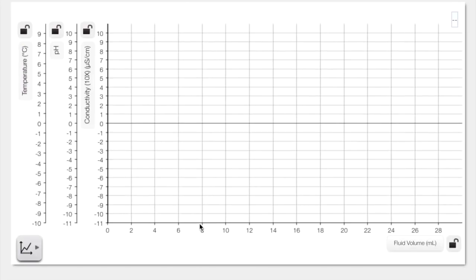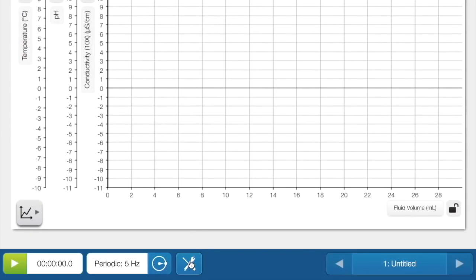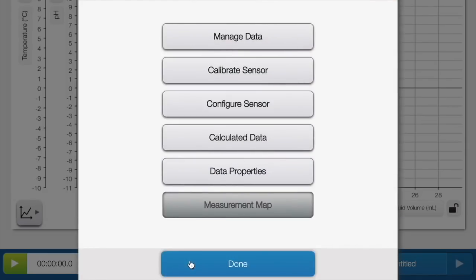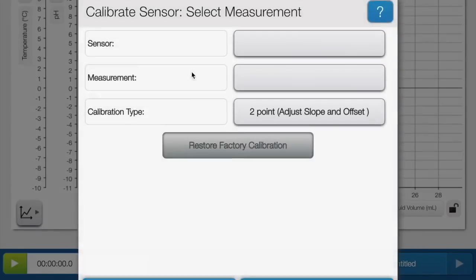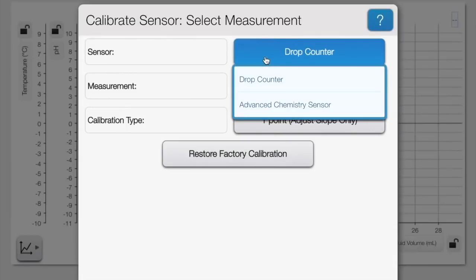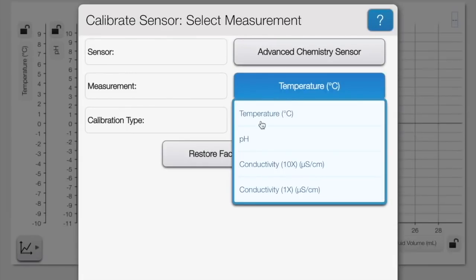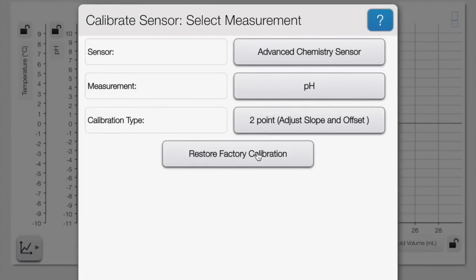Now you'll need to calibrate the pH sensor. This is done by clicking on the tools button and then pressing calibrate sensor. Choose the advanced chemistry sensor then pH then two-point calibration and then next.